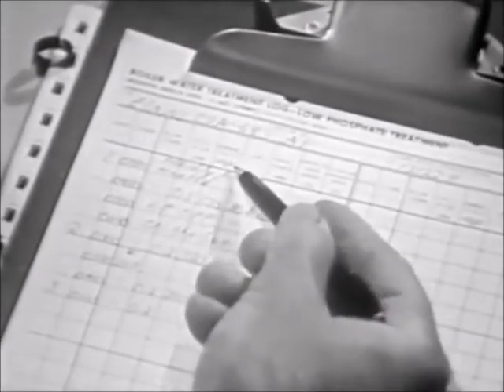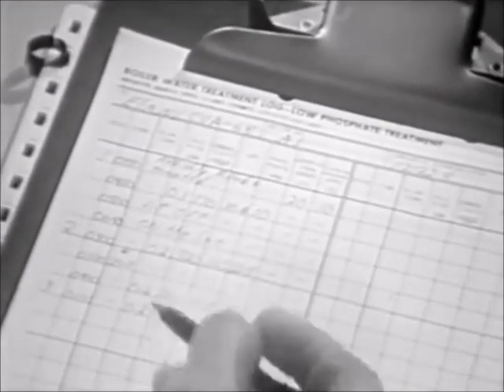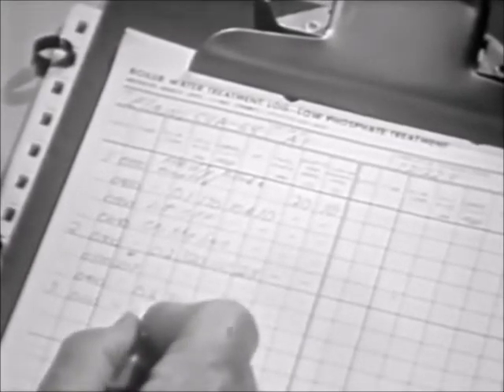For 600 pound per square inch boilers and below, this reading should not exceed 1300 micromhos per centimeter. For 1200 pound boilers, it should not exceed 700 micromhos per centimeter. If your reading exceeds these values, it indicates an excess of dissolved solids and corrective action should be taken.